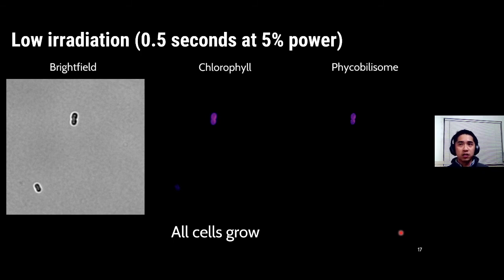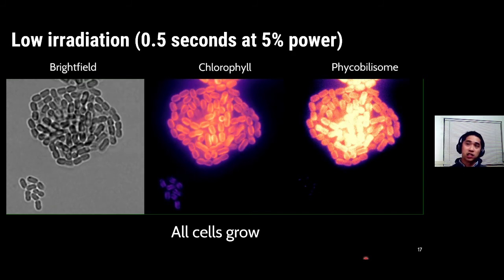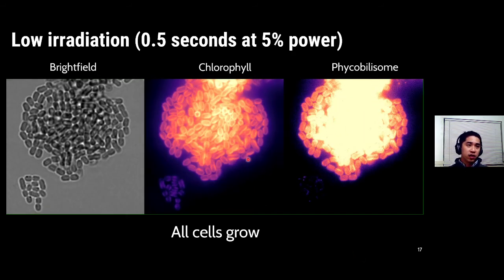All right, so I'm going to show you now a video of the cells in the low light condition. So here, I'd like to draw your attention here, so we have a delta CPC cell down here, and we have a wild-type cell up here. And same in all the different fluorescence channels as well. So I'm just going to play the movie, and the cells get irradiated about here. And as you can see, they basically just keep growing. One thing I'd like to point out here is if you look at this wild-type colony here, by the end of the movie, the wild-type colony gets very large, and you can see from the brightfield image that these cells are basically growing on top of each other. So our computational toolboxes cannot track the cells once the colonies grow this large, so we typically will stop tracking the wild-type cells before the delta CPC cells. The delta CPC cells here grow about twice as slowly, so this is less of a problem for these colonies.